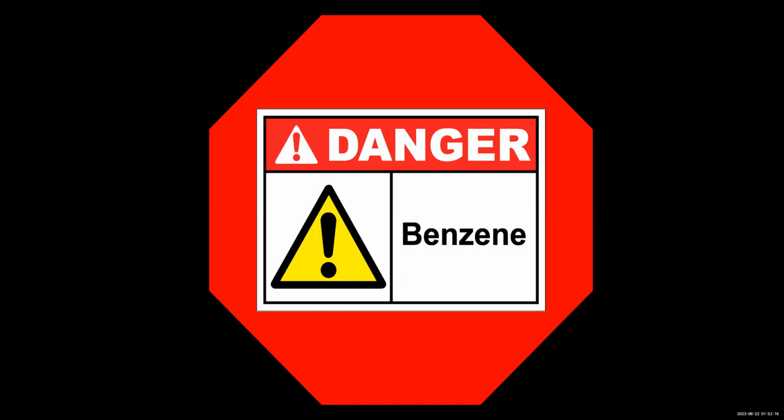Both CDDT and cyclohexane are available for use, but benzene, however, was not used in this experiment due to its concerning safety hazards. Benzene is a known carcinogen. It has the ability to cause blood disorders, neurotoxic effects, reproductive effects, and it is an irritant. So it's really fun, right? Anyways, due to these hazards, reported values for benzene's heat of combustion were used for calculation purposes.